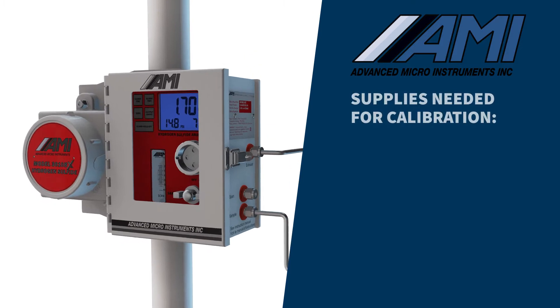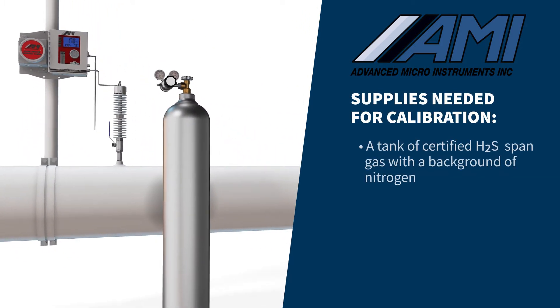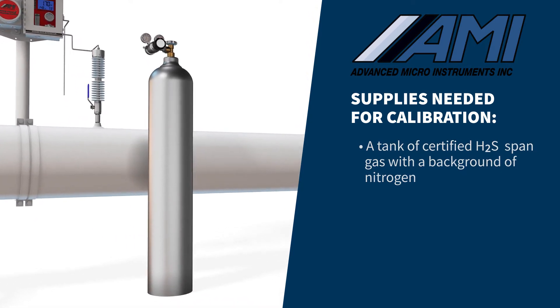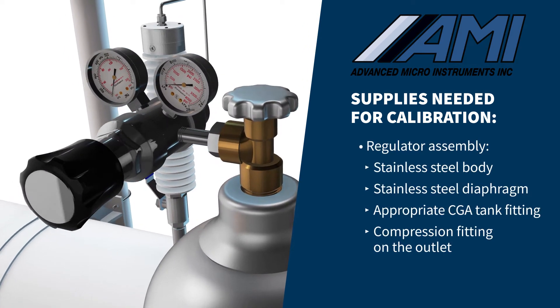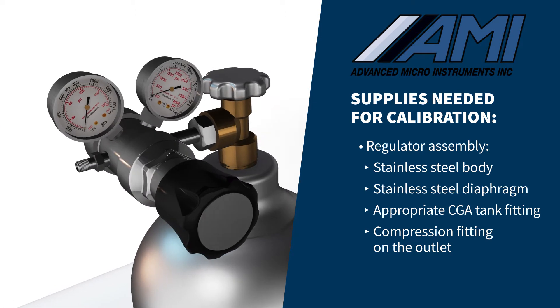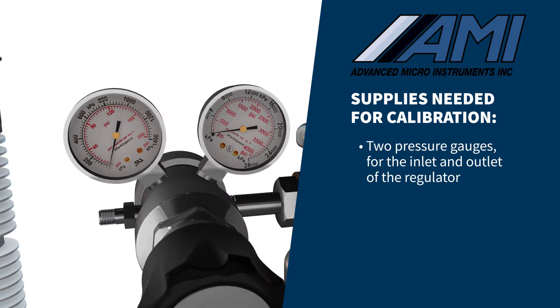To perform a proper calibration using span gas, you will need the following: a tank of certified hydrogen sulfide span gas with a background of nitrogen, and a stainless steel body regulator with a stainless steel diaphragm, outfitted with the appropriate CGA tank fitting and quarter-inch compression fitting on the outlet, plus two pressure gauges for the inlet and outlet of the regulator.